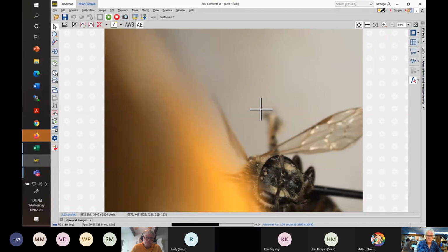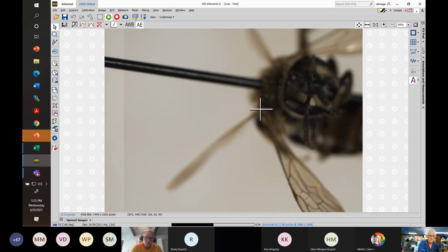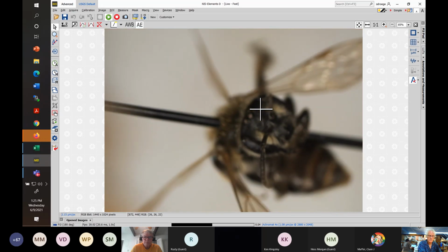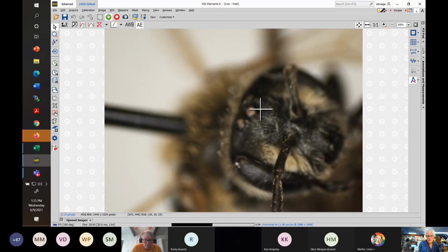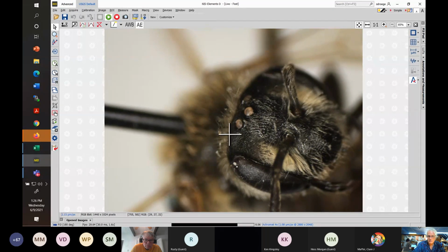So this is a female, and this is Andrena nasonii, a species that is very abundant in disturbed habitats and in general in the East. If we zoom up here, first of all, I want to point out the facial fovea, an incomplete look. It's quite broad at the top, not showing well because the reflectance isn't there, but it goes all the way up there, comes down, and there's the bottom of it. One of the features of Andrena nasonii females is a very broad facial fovea, extending from the eye to the ocelli in its upper surface.